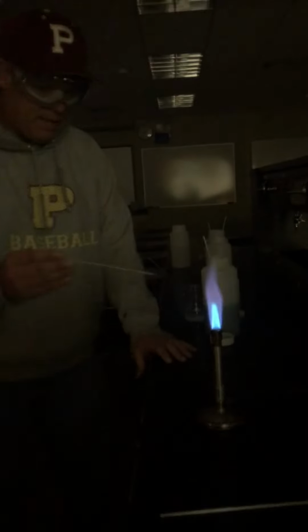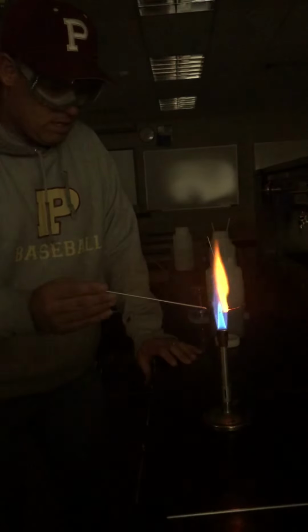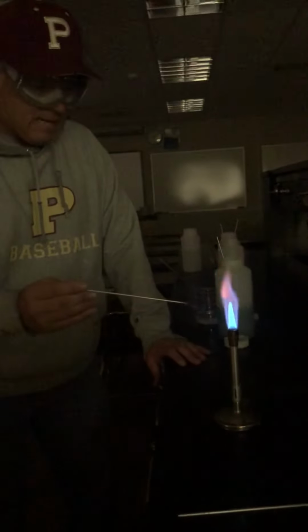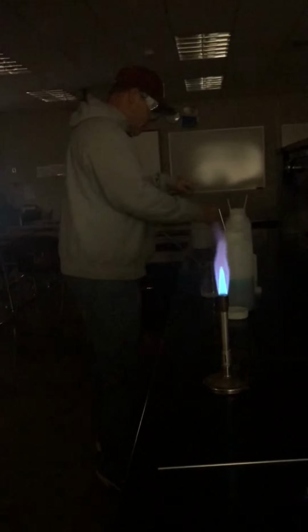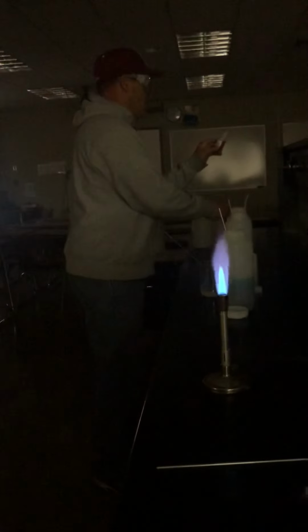So strontium looks like it's red. See that? See that? Red. Okay, good job. So strontium, red. That's what you need to remember. Okay? So the next one that we're going to have is iron.